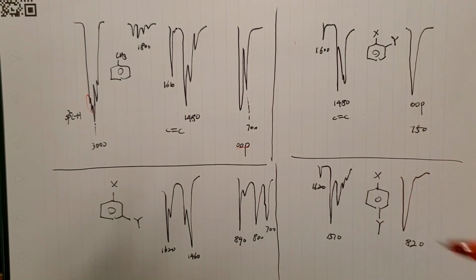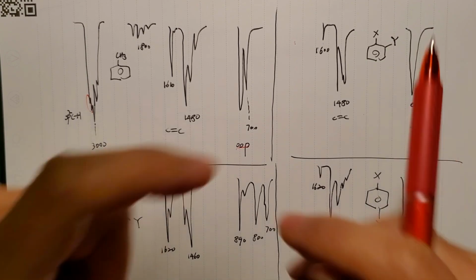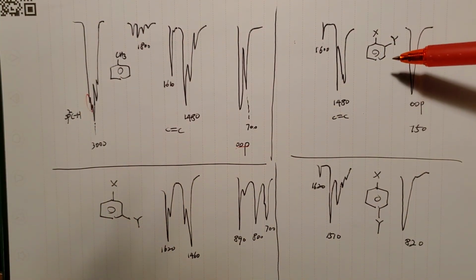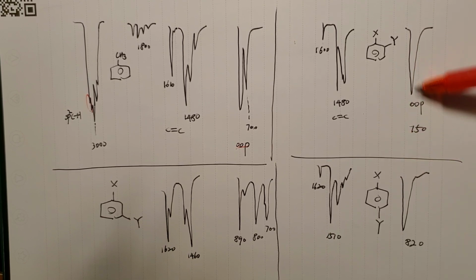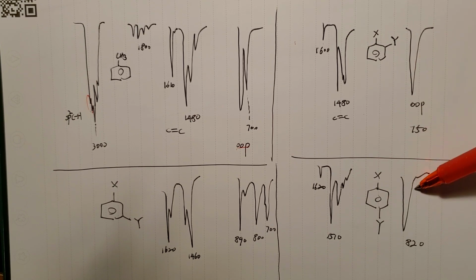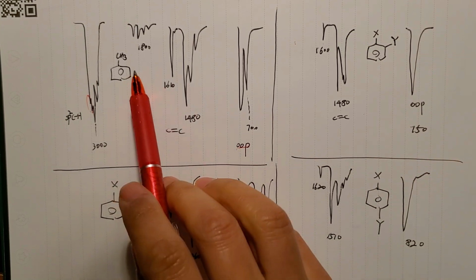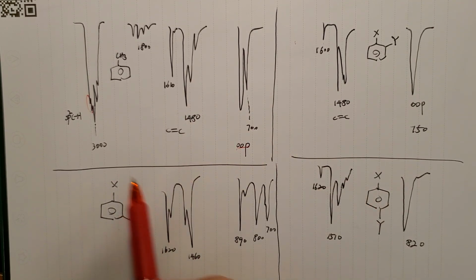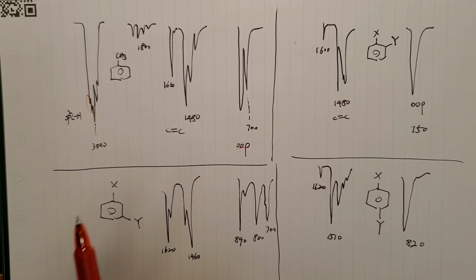Because the molecule is relatively more symmetric, and that mode of motion is not changing polarity as much. Also, the out of plane around 700, 800, they are simpler, 1. Okay? And the mono and the meta, they are the more complex, especially the meta di-substituted one. As you can see, 1620 is very intense. And you have a couple peaks and a couple more peaks.